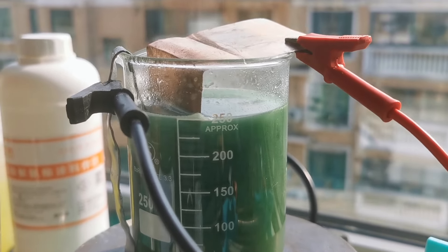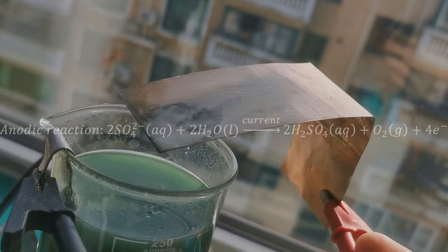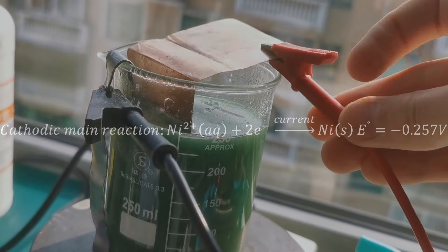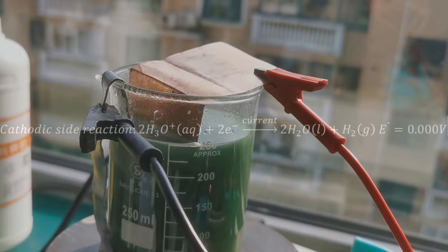I discovered that the pH of the electrolyte had dropped well below 1. The anodic reaction in the cell releases oxygen, but also sulfuric acid, which stays in the bath and lowers the pH until the reduction of hydronium ions is favored at the cathode over nickel ions, thereby forming hydrogen instead of nickel.